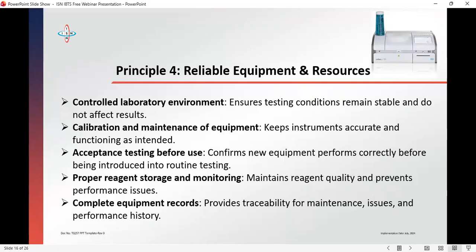So it is a requirement for all testing laboratories to have those records at hand. And if you are to attain or to be assessed on ISO 15189, you need to have all those documents. You don't throw it away. In my house, once I get the TV out of the box, every other thing, I throw it away, because I don't want rats in my house. For the lab, it is very important that you do it.